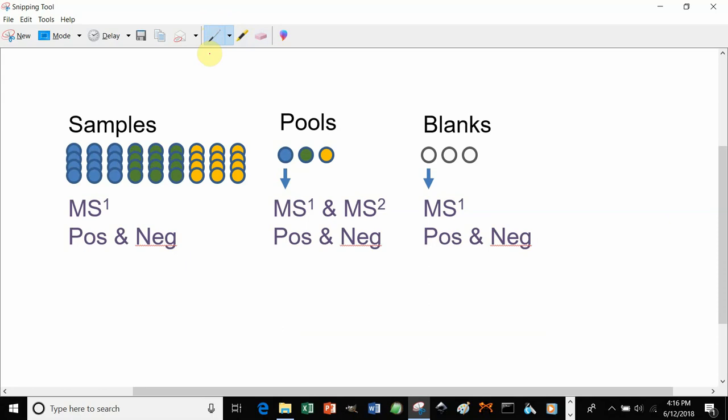When you're acquiring your data for your samples, acquire all data for all samples in full scan only, in both positive and negative polarity.